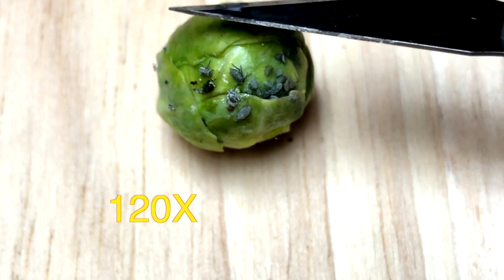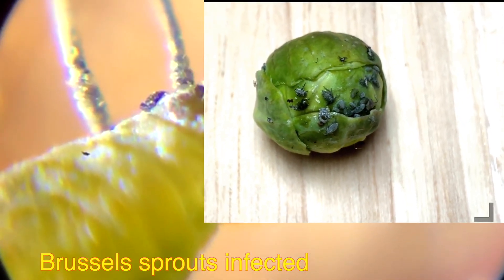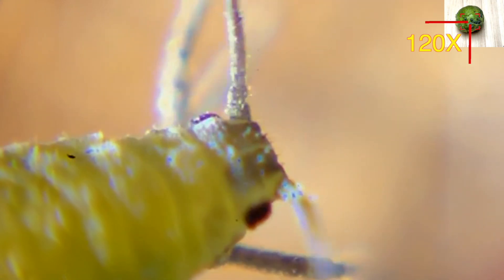Hello and welcome back friends. Today we will be looking at a lot of things under 120 magnification. These are Brussels sprouts — they get infected by these aphids. They are very robust and cold-surviving.